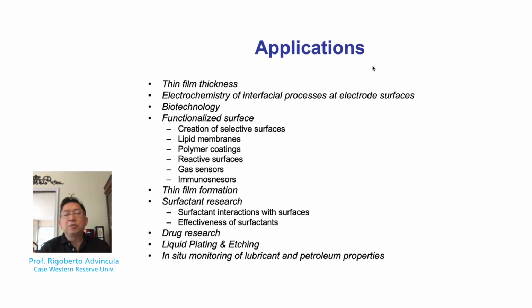There are actually limitations in terms of the thickness and sensitivity of this measurement, which we'll try to cover, in that these are in the regime of nanometer sensitivity and nanogram sensitivity. Thus, QCM is sometimes labeled as a nano-sensitive tool for investigating this chemistry.